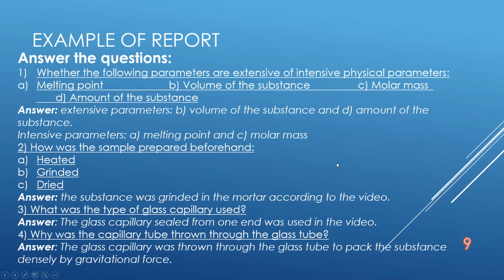Because in the video we could see the thick-walled clay bowl called a mortar. And the mortar is used for grinding large particles to fine powder. Large particles could also be crystals. So in many cases, clear, pure substances can be found in the form of large crystals. They should be ground to a much smaller form to be analyzed later.